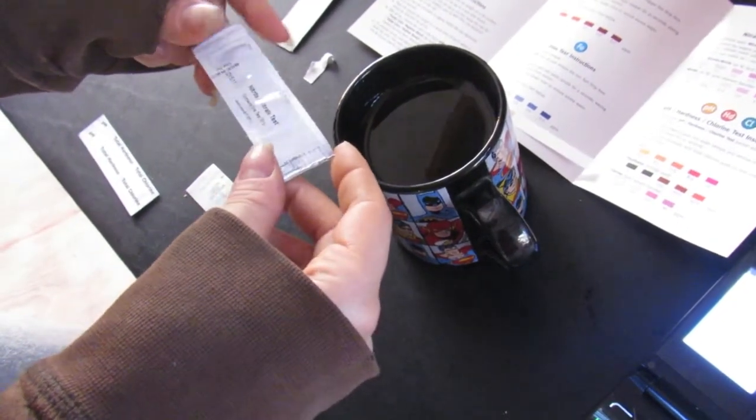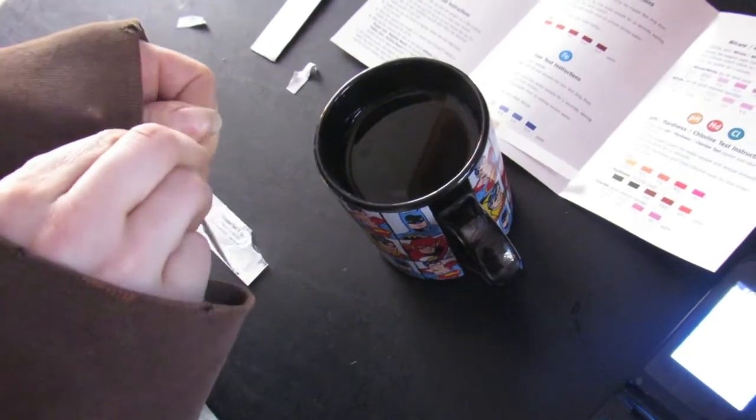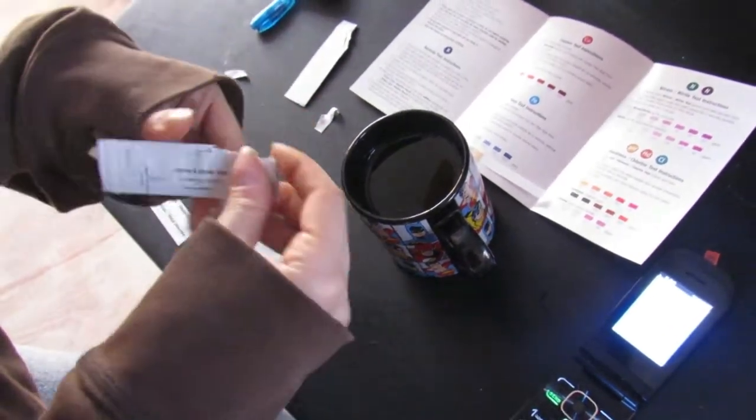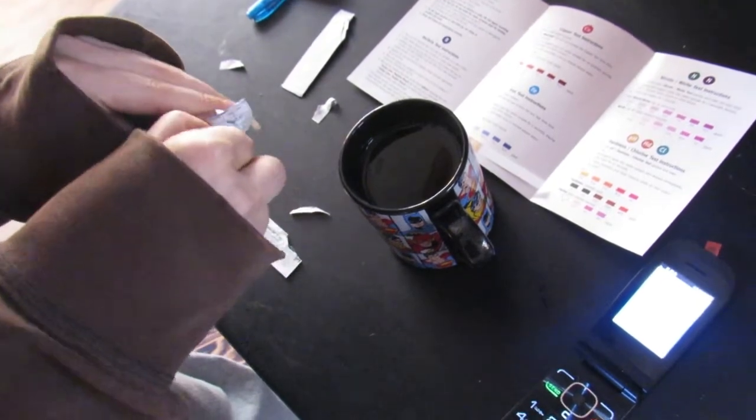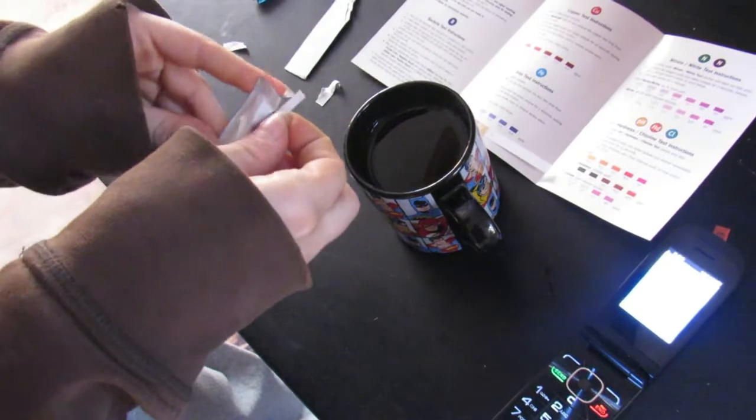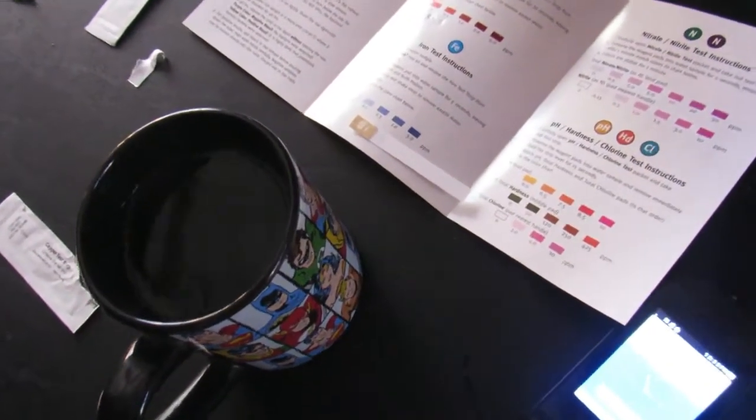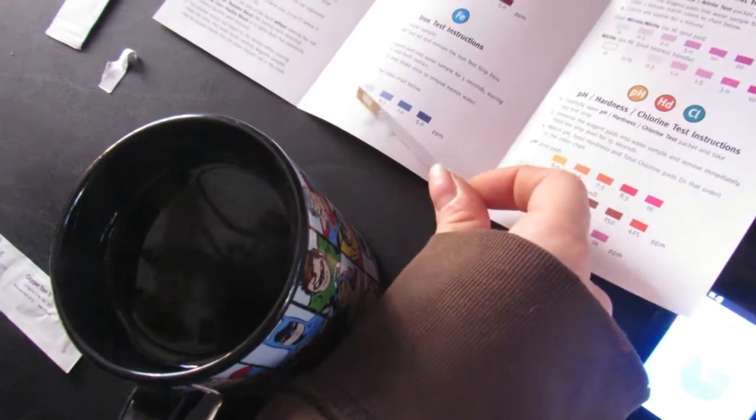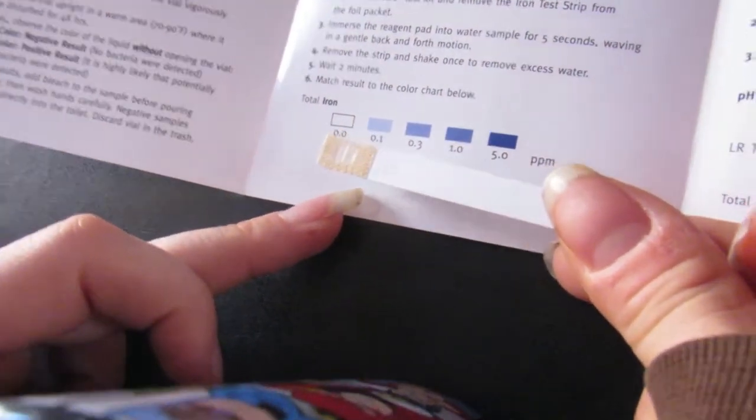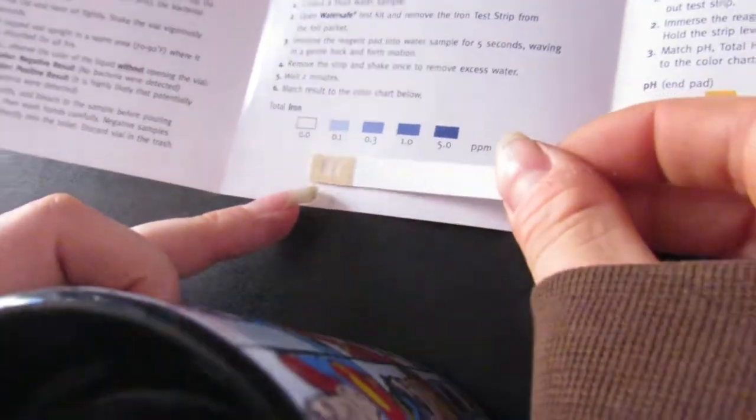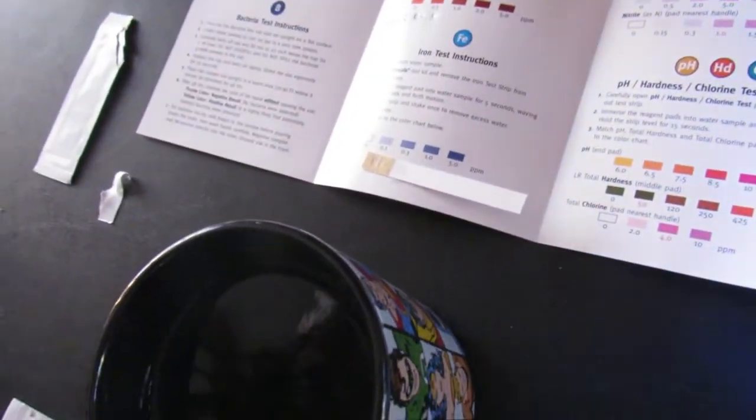We'll move on to the nitrate nitrite. Carefully open it and take out test strips. Still got my timer going for the other one. My two minutes for the iron test is up, so I'm going to check that one now. And it didn't really change. So that's good. It's a little bit more than the zero, but not even close to the 0.1. So we're looking good there. I'll write the results down.